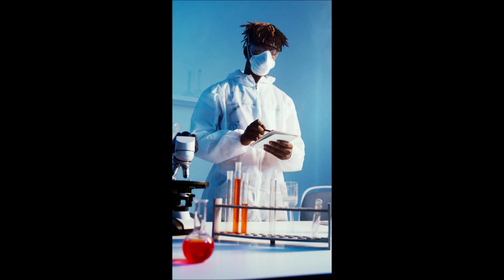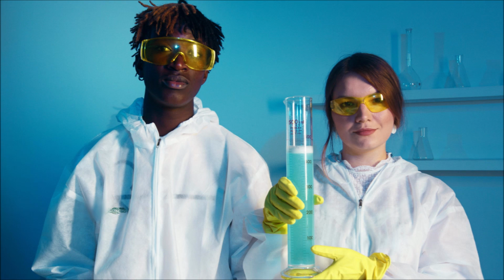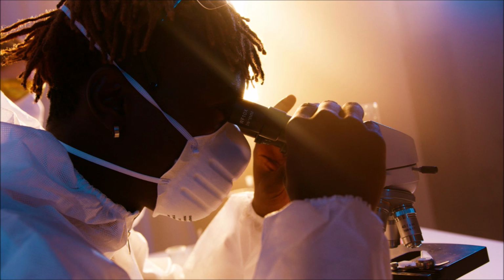Different plant parts: endophytes can be found in leaves, stems, roots, and seeds, so sample multiple sections. Another thing to factor in is the environmental conditions. Plants from diverse ecosystems may host unique endophytes, so consider sampling from different locations.